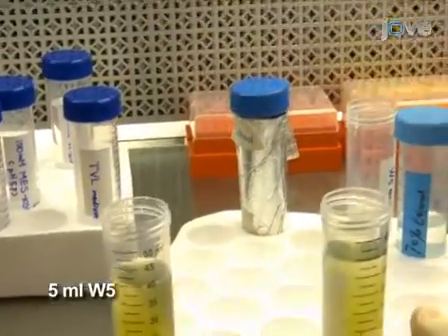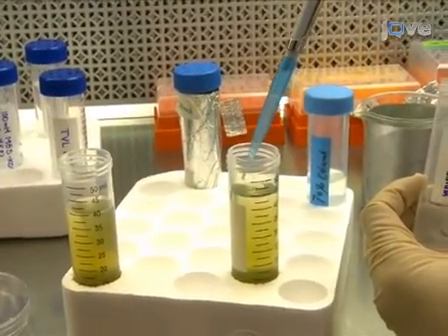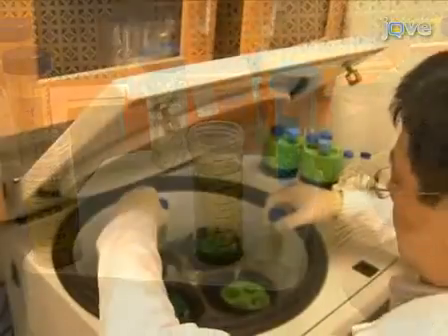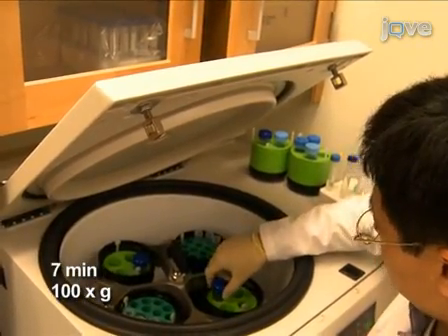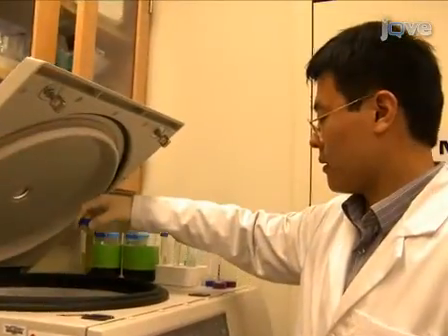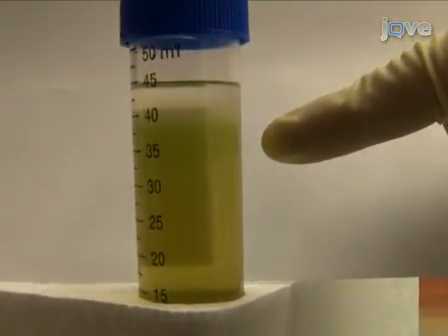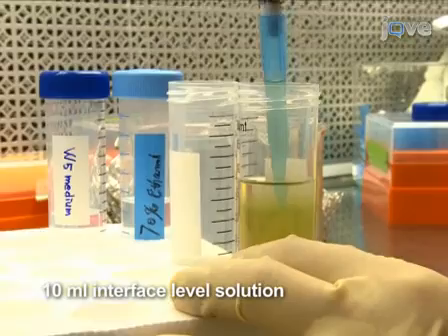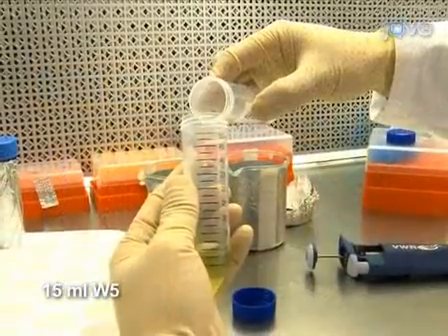Carefully overlay the protoplasts with 5 milliliters of W5 solution. Be careful not to disturb the sugar gradient formed by adding the W5 solution. Next, centrifuge the protoplasts for 7 minutes at 100 g's. The protoplasts collect at the interface of the enzyme solution and the W5 solution. Collect 10 milliliters of liquid at the interface, transfer the collected protoplasts to a new 50-milliliter Falcon tube, and add 15 milliliters of W5 solution.